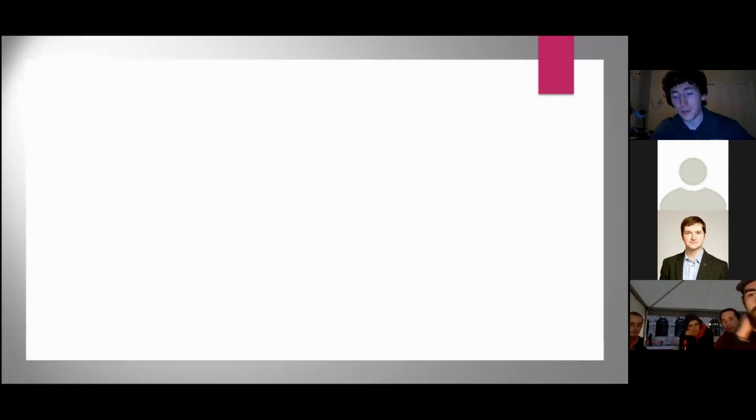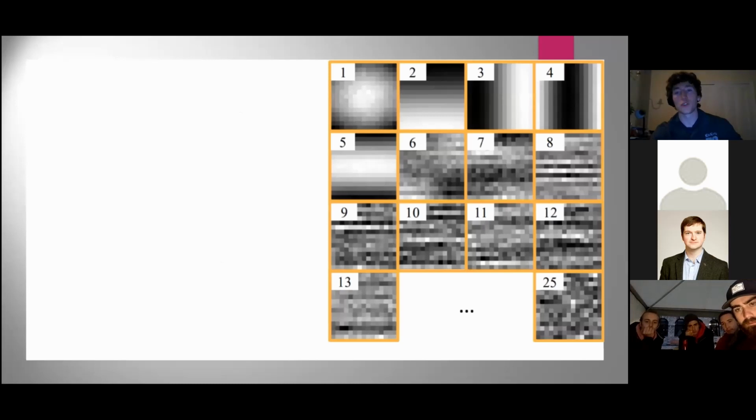So when we take out a bunch of different patches, we perform what's called randomized singular value decomposition. At its most basic level, it's just identifying the key components of the data. If we take a look at what the components are here, there's the central blob, which we would imagine, of course, is going to be a key feature of any data set where point spread functions are all over the place. But these subsequent features describe the edges of blobs, intersections between blobs, the diagonal intersections, and lines like these could include information about scan noise. This is where, as your detector is scanning across your specimen, the specimen is kind of moving a little under it, and it can bring about these lines.